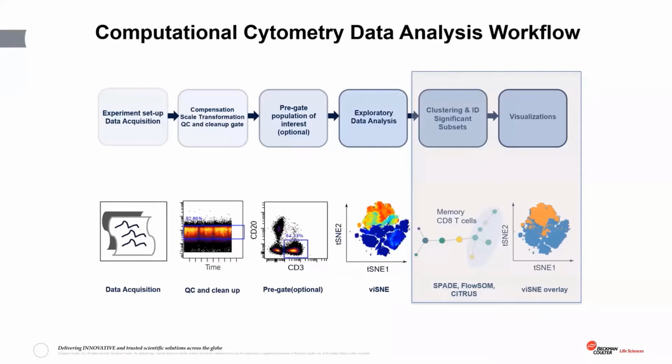As we've seen before, we really want to illustrate the context of using these tools we've been learning about within your complete data analysis workflow. Before you begin, it's really important that you properly prepare your data with good controls during data acquisition, check your compensation and apply appropriate scaling, and do pre-gating to exclude dead cells, debris, aggregates, or unstable segments of data acquisition.